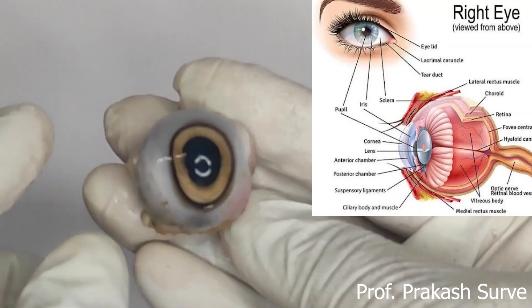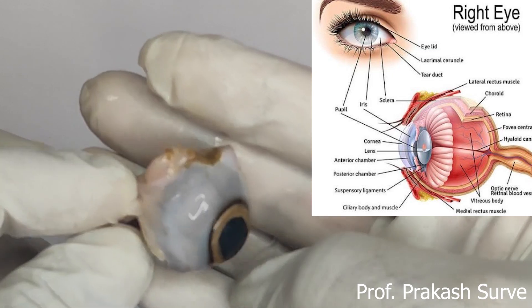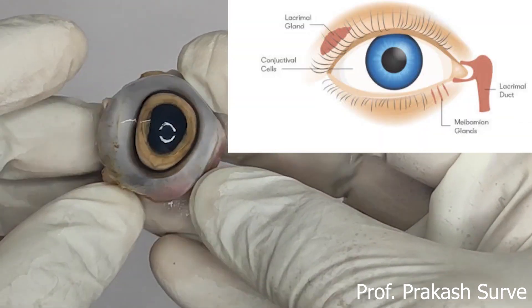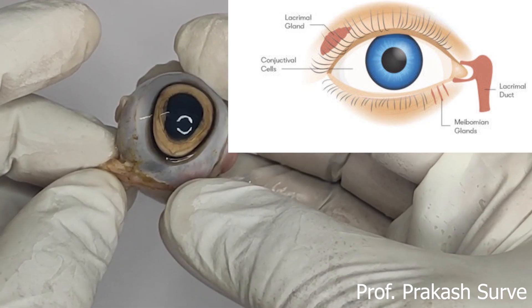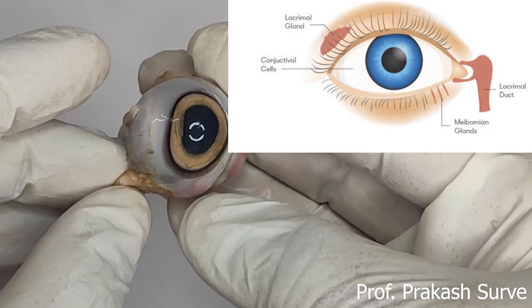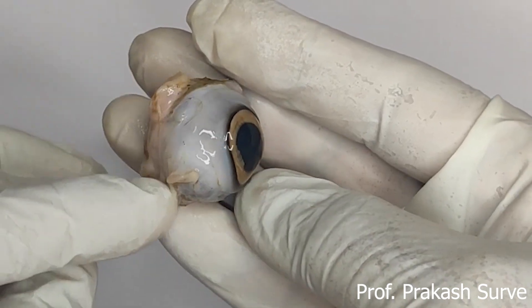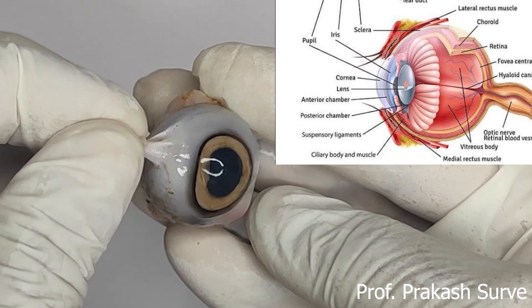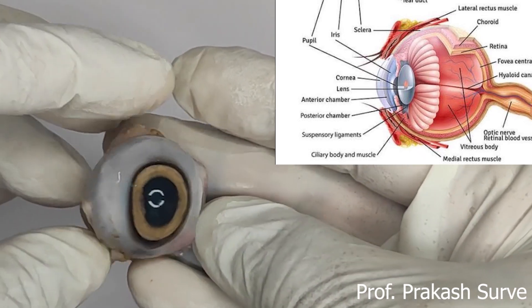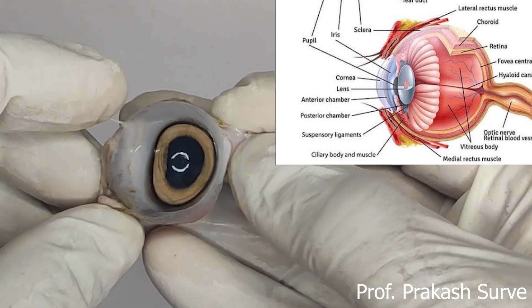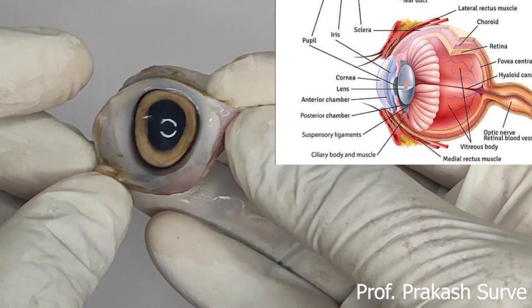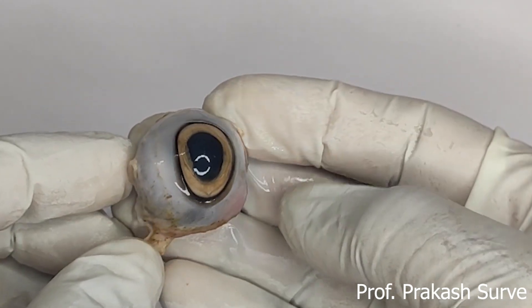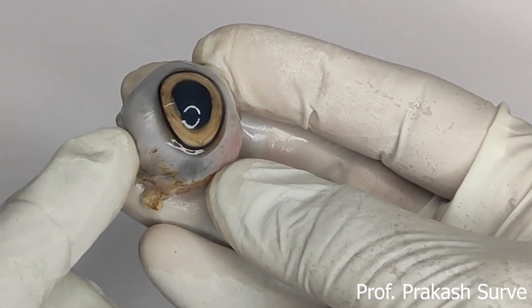On the side you can observe some moisture — the lacrimal glands, or tear glands, are present there. The movement of this eyeball is controlled by six sets of muscles, which allow movement in the lower, upper, and side directions.